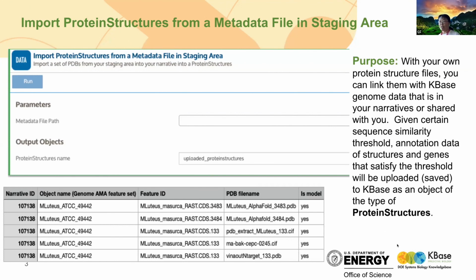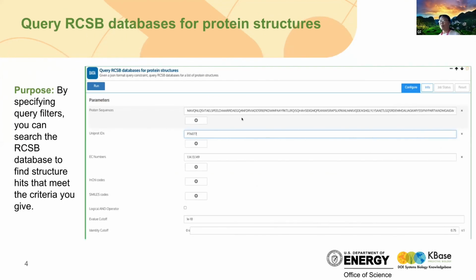So that's the purpose: eventually, if a certain sequence identity threshold is met, then you want to upload this into, as I said earlier, the protein structures data object. The second one is to programmatically install the interface Dennis was showing, the query.